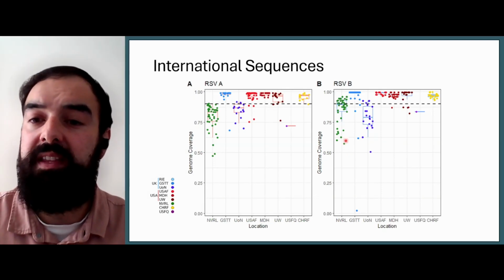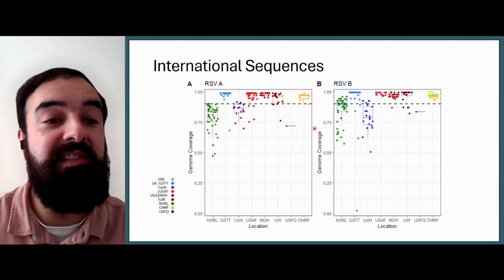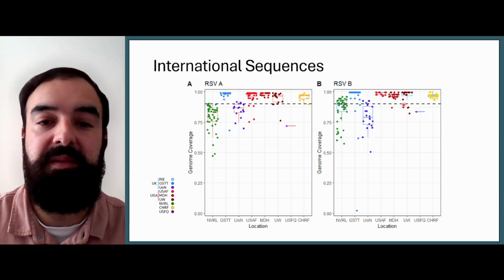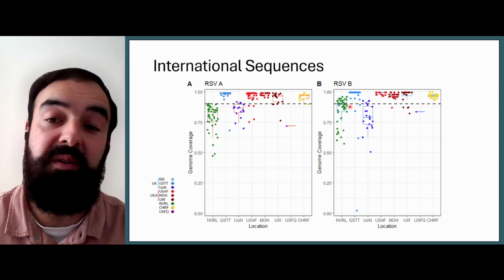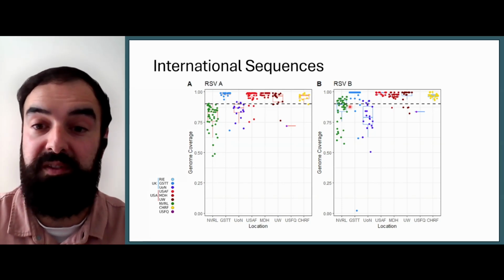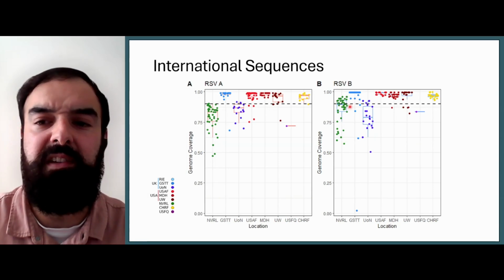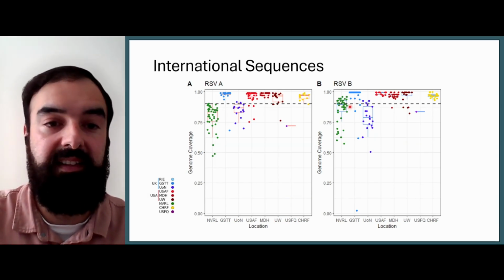For the most part, these primer schemes have worked really well in the hands of our collaborating labs, again, with the majority of samples having over the 90% coverage mark. And these external labs used a range of sequencing platforms, with 4 using nanopore sequencing technology and 4 others using Illumina sequencing methods. And most enacted a rough CT cutoff of about CT30 for their sample selection.